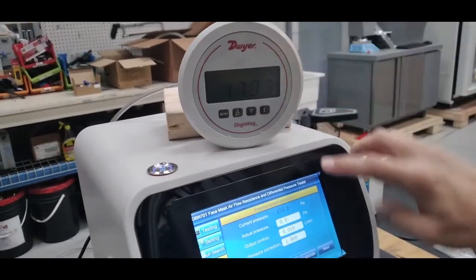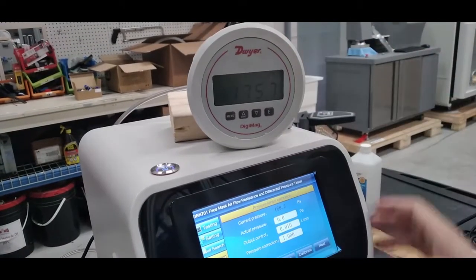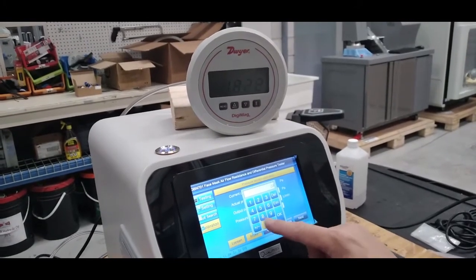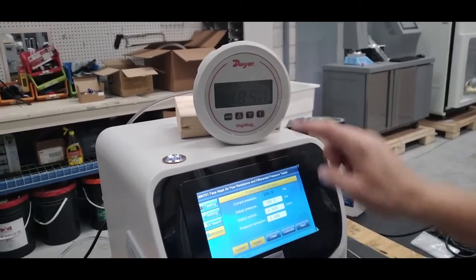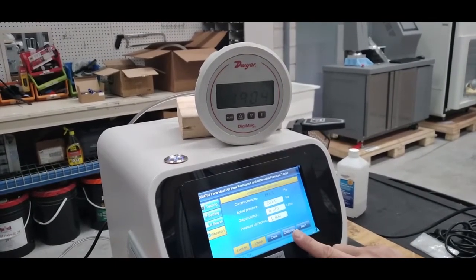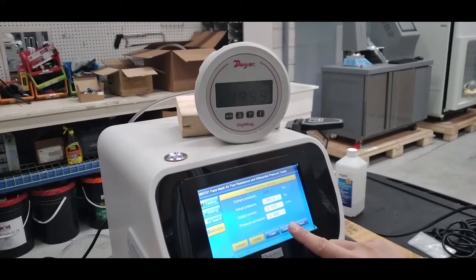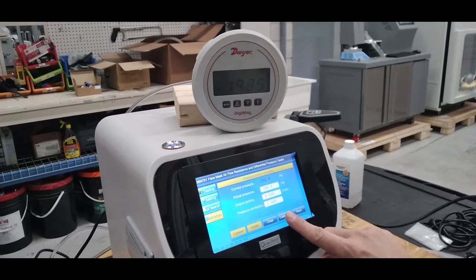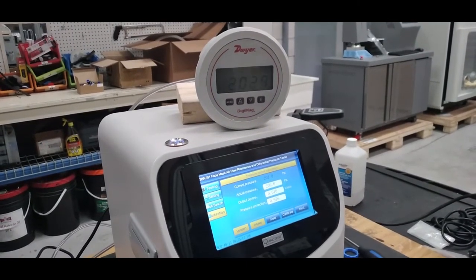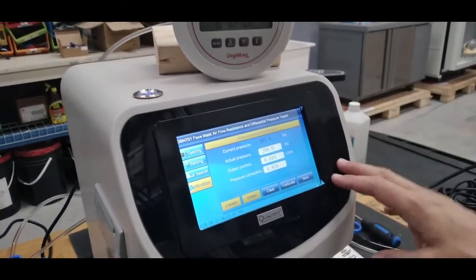Your gauge should be reading the same as your current pressure. If it is not, apply the correction factor. Wait until it reaches 200, then press calibrate — it applies the pressure correction factor and the calibration is complete.